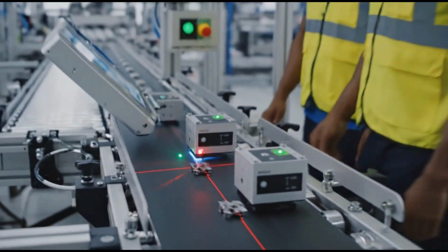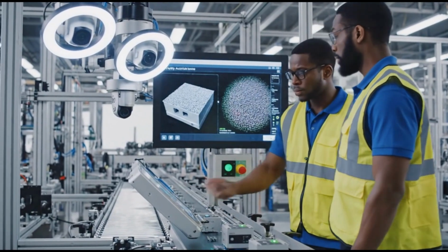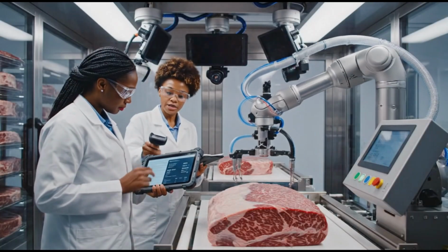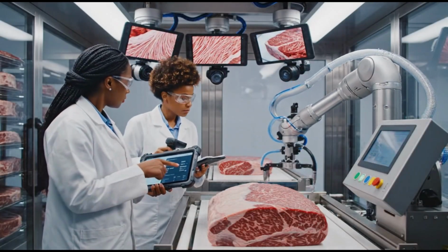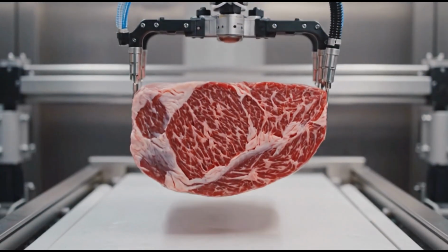The thickness sensor on line 3 is spiking again, adjusting the tolerance down slightly. Looks stable now. Good catch. The adjustments are holding steady across the batch. Confirmed. The fibers look consistent with the target texture.